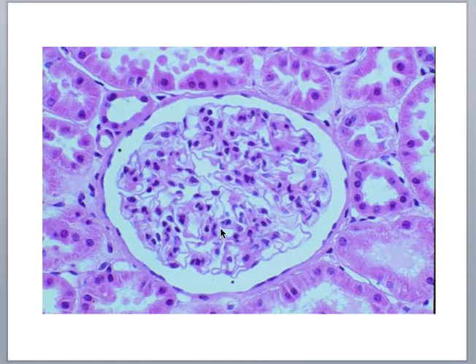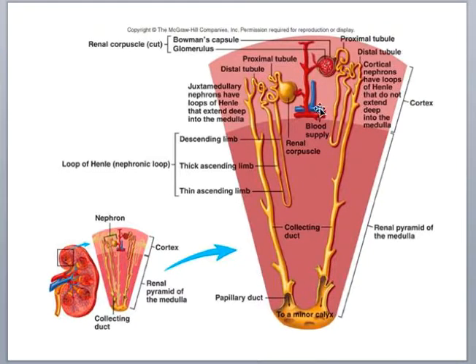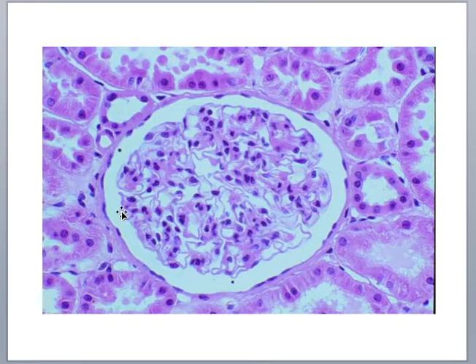If you want to find these, you're going to want to look out closer to the renal cortex, because if you remember, I drew a little dotted line right here, and the renal corpuscle, the proximal and distal convoluted tubules, those are all located primarily in the cortex, and it's only the loop of Henle that dips down into the medulla. Look in this slide, corpuscle in the cortex, okay? Proximals and distals in the cortex. So you're going to want to look towards the cortex, and you'll see lots of them as you're on low power and scanning. It's really hard to miss these big ball structures.